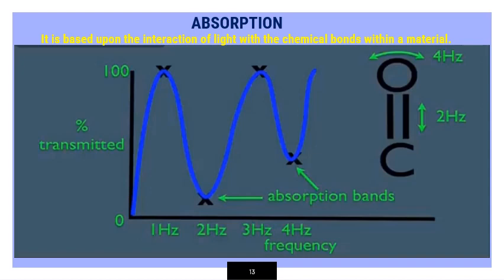For instance, it's safe to assume that if the carbon were singly bonded to the oxygen, remember, single bonds are longer than double bonds. So you can think of that single bond as being a different type of quote-unquote spring than the double bond, which means if your molecule had a C singly bonded to an oxygen, that bond would stretch and wag at different frequencies than the C double bonded to the O, and would therefore have its own unique absorption bands. So notice what the IR helps us figure out. It simply helps us determine what functional groups might be present in a molecule.